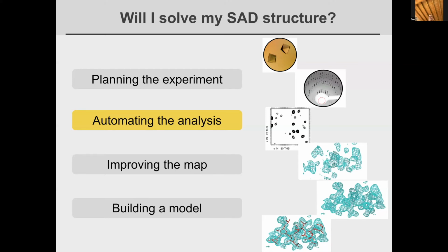So the contrasting experiment to carry out is, instead of collecting the data from one rotation exactly the same way a bunch of times, if you take a bunch of crystals or make the same crystal and you rotate it in totally different ways, then many of the systematic errors will cancel out and you will get much more accurate overall data. So a good way to know whether your data is actually accurate is to collect it from multiple crystals, and then you average those data, and that tells you how accurate the data really are.